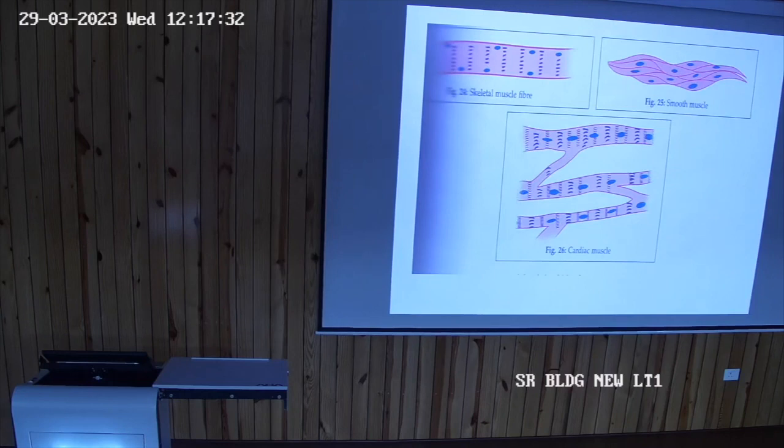Right? Striations you will see in the LS of the cardiac muscle and also in the LS of the skeletal muscle. The difference remains in the position of the nuclei. Understand? And the third point is branching. Look, this muscle fiber is branched with this muscle fiber. This is branched with that. So a branching pattern is there.